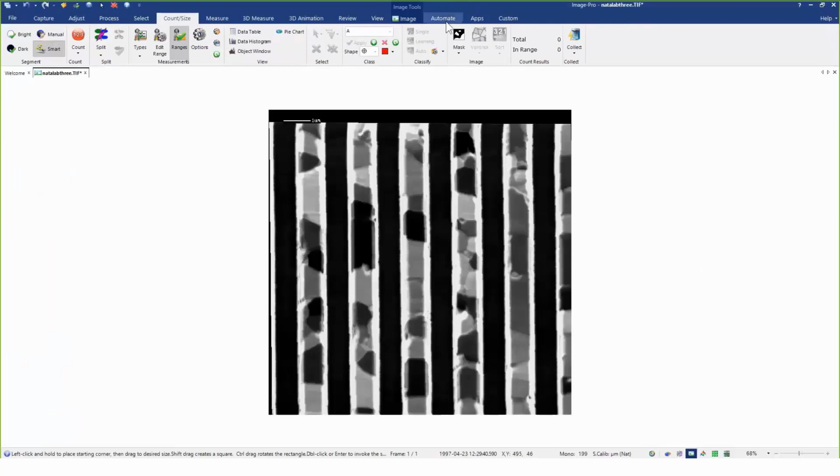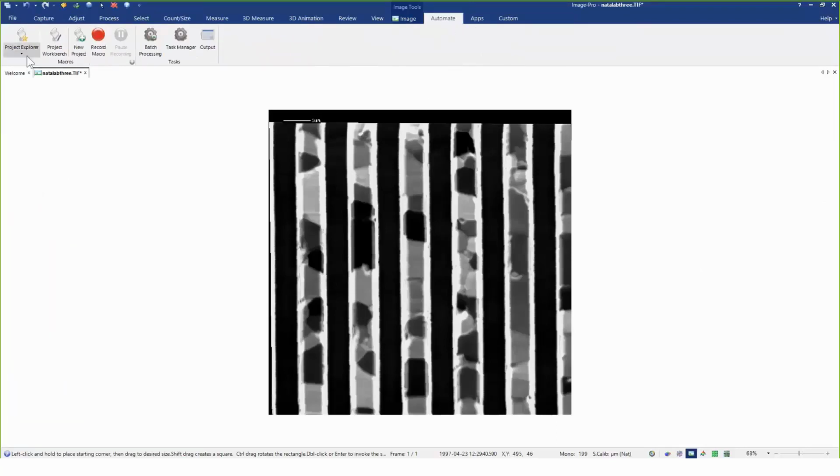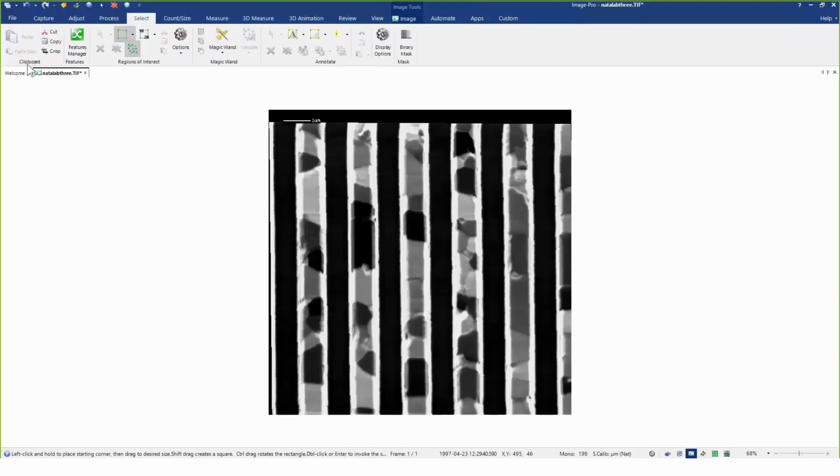So in this case, I want to run my region of interest macro that's going to prompt me to draw a region of interest. Please draw the ROIs. Again, you can put directions on what the person should do. I'm already in the correct tool, and so now, again, whether I was using Feature Manager, I can now draw my ROIs. I may want to make a little adjustment, or I may just say in the center there. Now I'm going to redo that one just a little bit. I know I'm going to pick up some of that edge that I don't want. There we go.